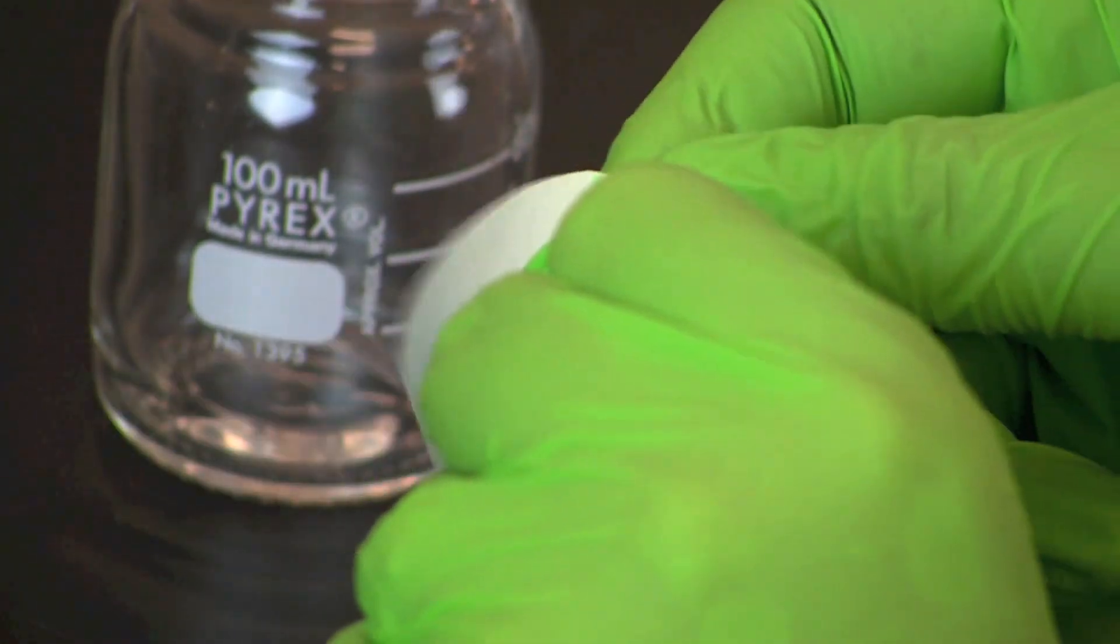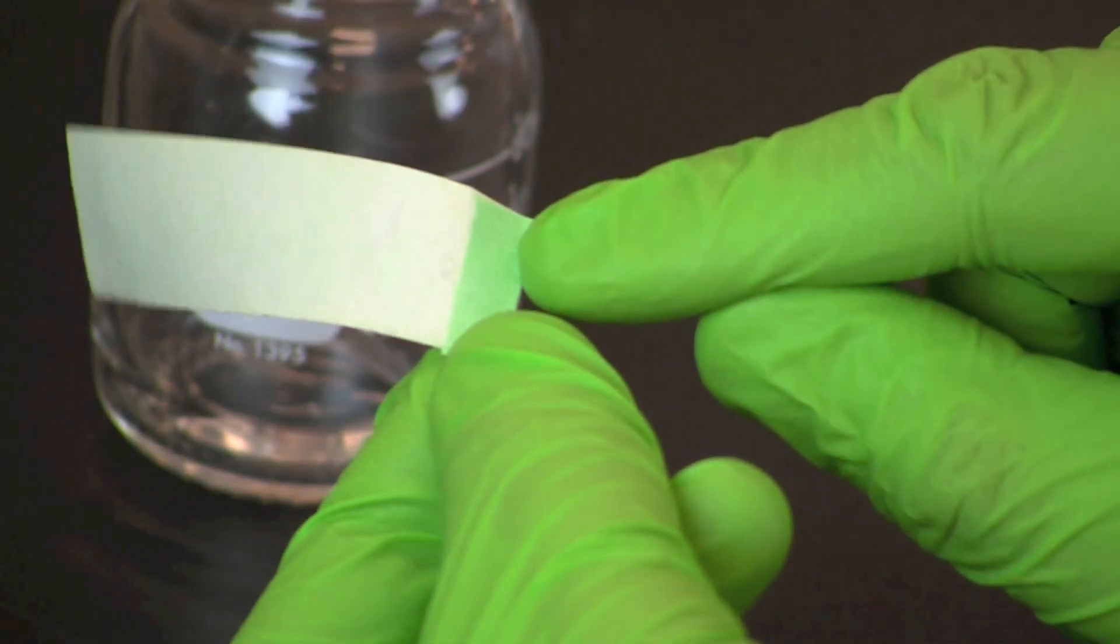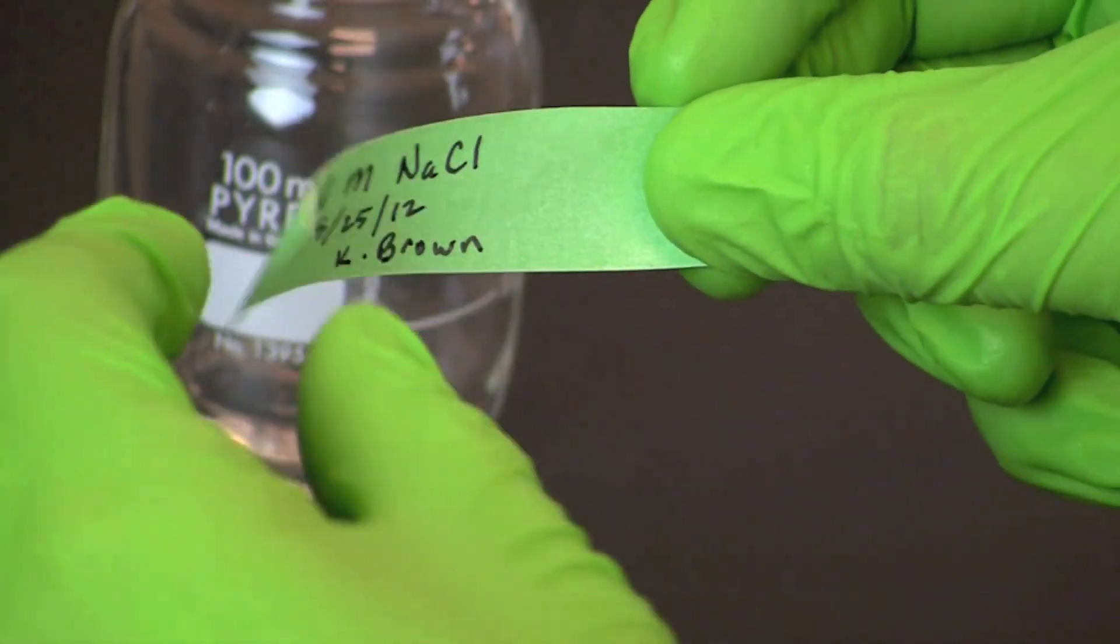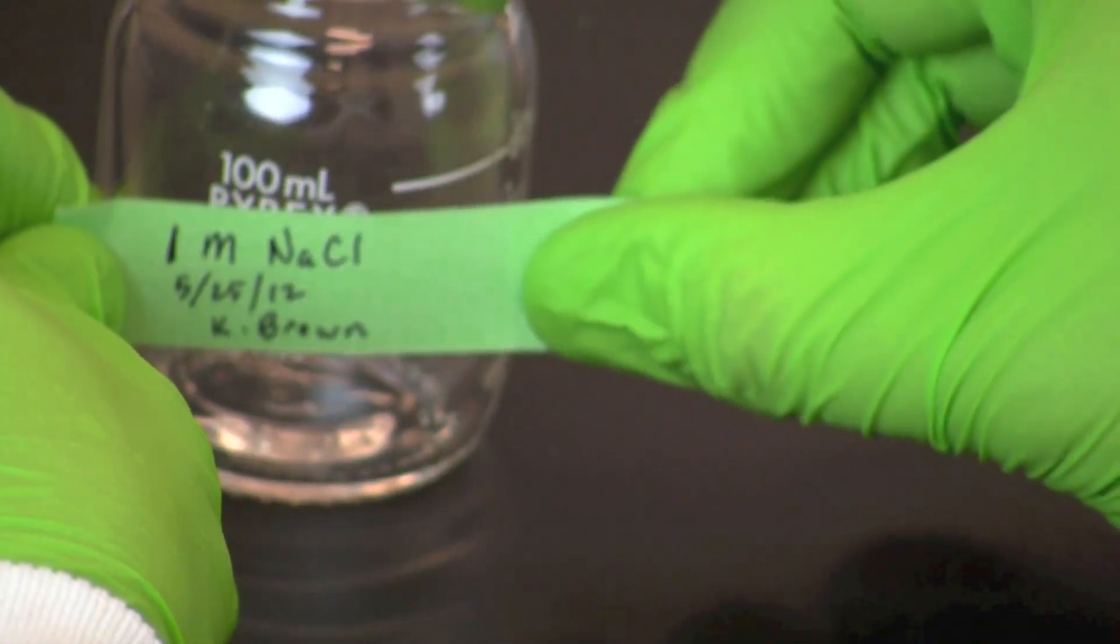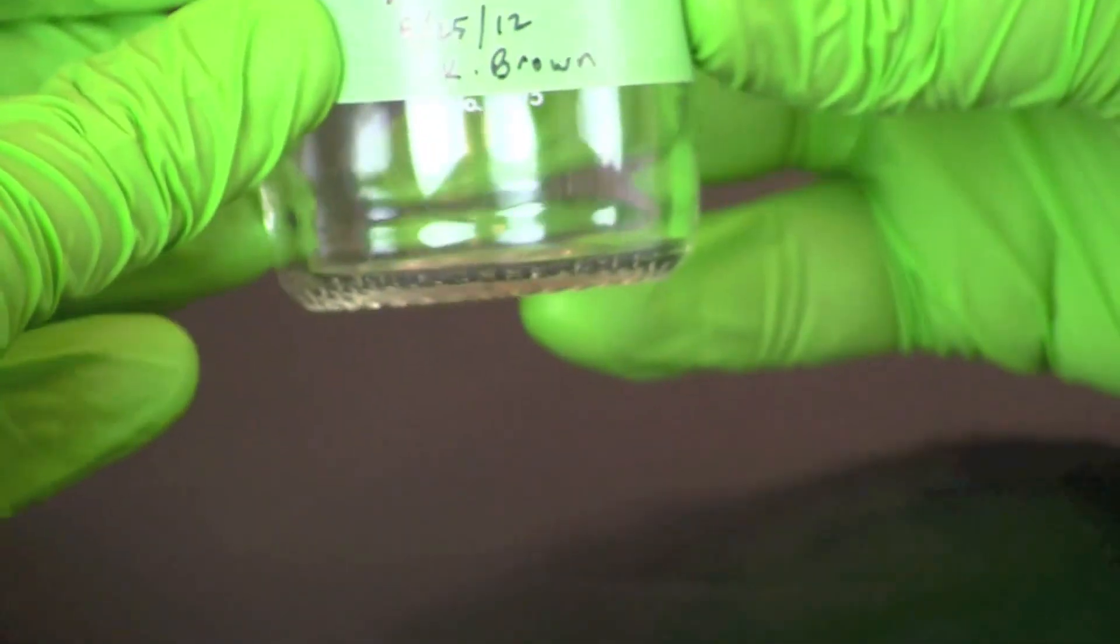Folding the side of the label will make it easier to remove the label at a later date. Place the label firmly onto the reagent bottle.